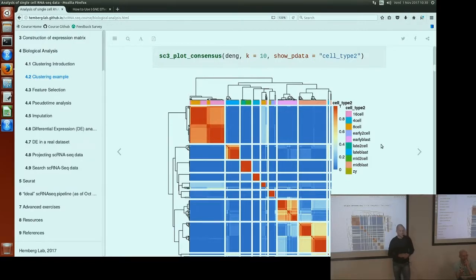I think the answer is that k-means clustering, the method, is only guaranteed to work if your clusters are sort of Gaussian in nature and reasonably separated. If you do a log transformation of the data, and you don't have too many zeros in there, it should be reasonably Gaussian. But the second problem has to do with separation of clusters. If two clusters aren't properly separated, you're never going to be able to distinguish them. Any method is going to have that problem.